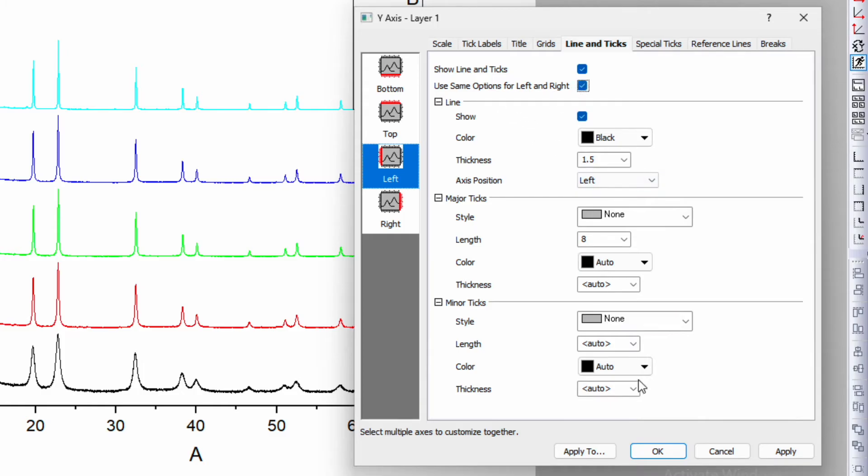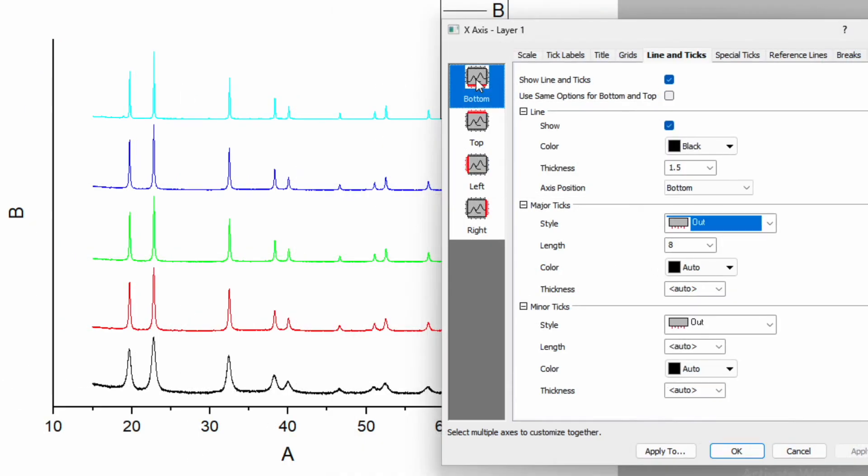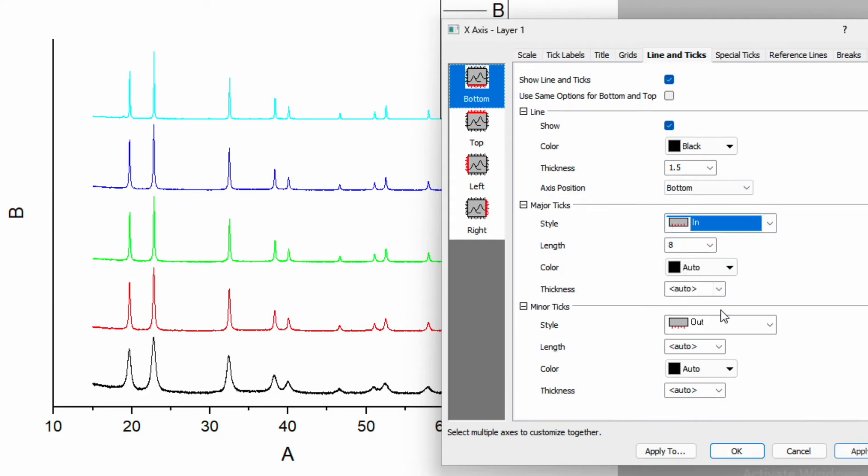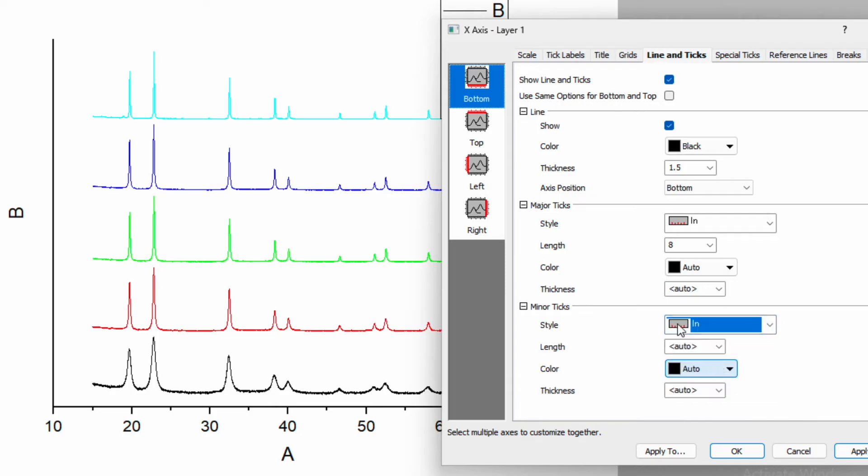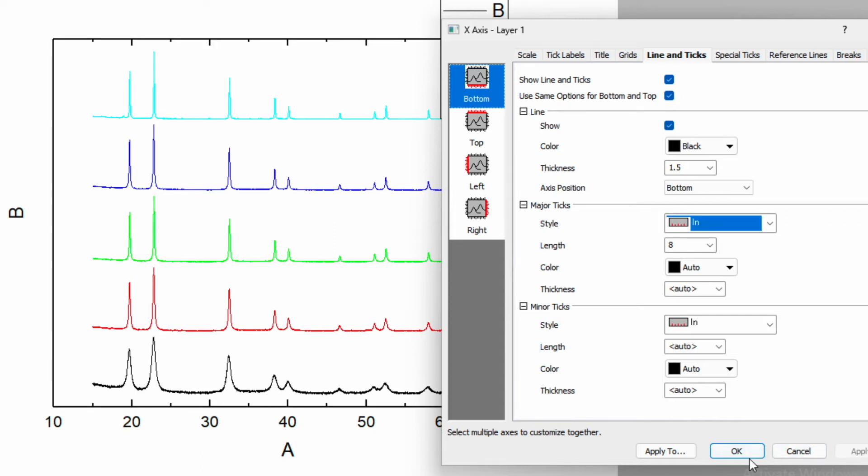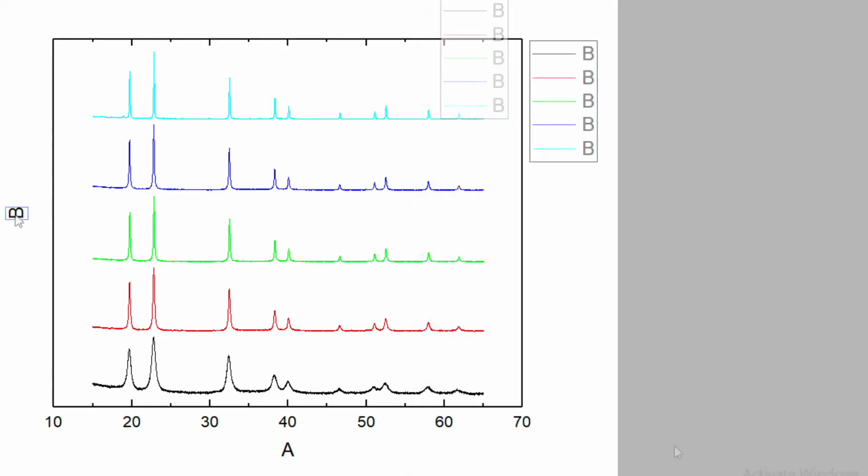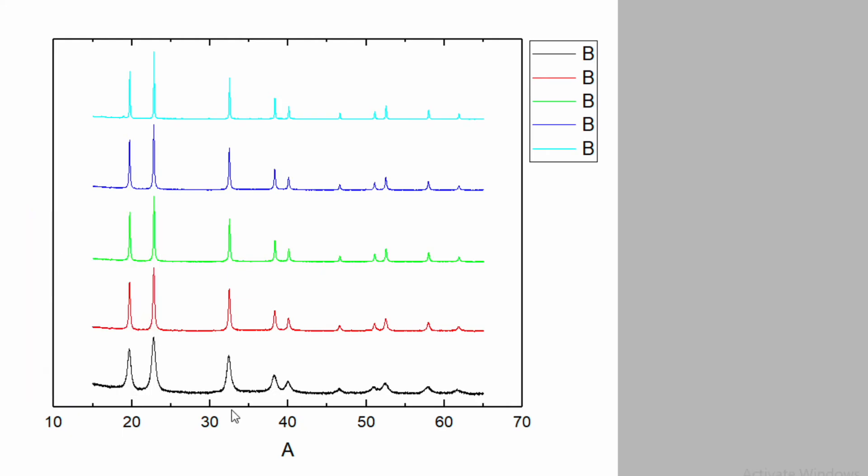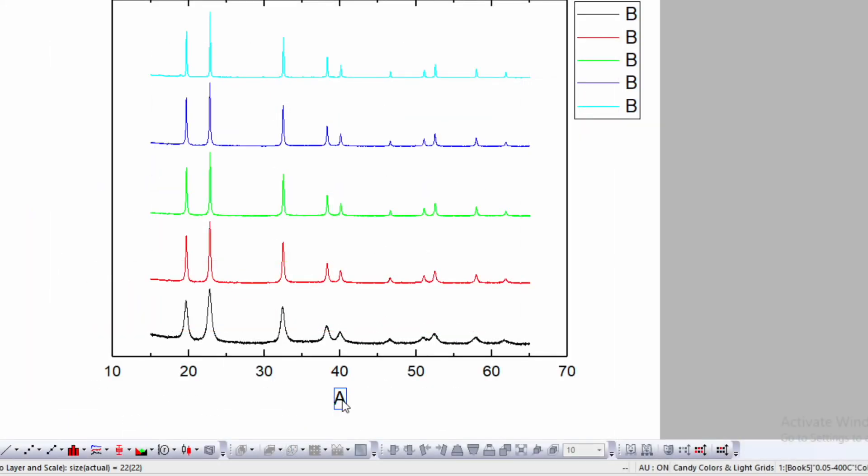Apply this style to both left and right axes by checking the box and applying. Similarly, click on the bottom which shows line and ticks. Go to major and minor ticks and use the same option for both bottom and top. Check the box and apply. Right-click and delete the label.